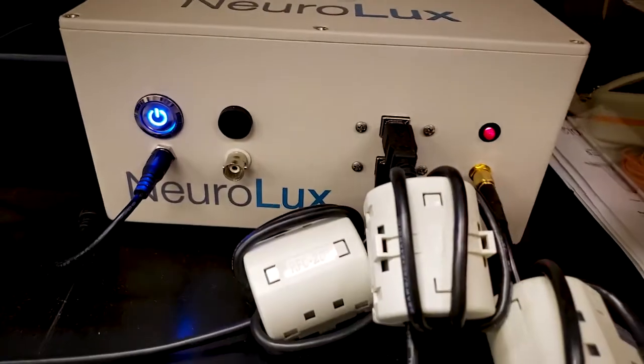One of the studies we're doing in the lab right now has to do with optogenetics. That's what this cage is for, and you can see the micro-LEDs lit up when they're placed inside of it.